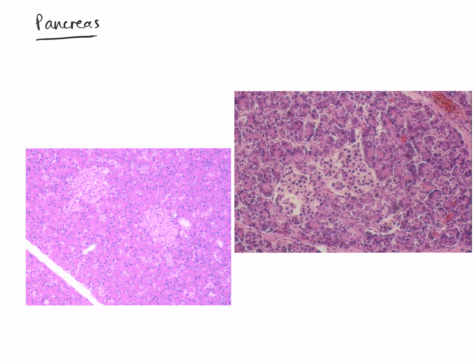Looking at the endocrine system here, so Vithia, as soon as I look at these slides, it'll take me probably about half a second before I realize that I'm looking at the pancreas. Can you please clarify what the distinguishing features of pancreas in a histological section are? So the pancreas has both an endocrine and an exocrine function, so therefore it has two distinct populations of cells.